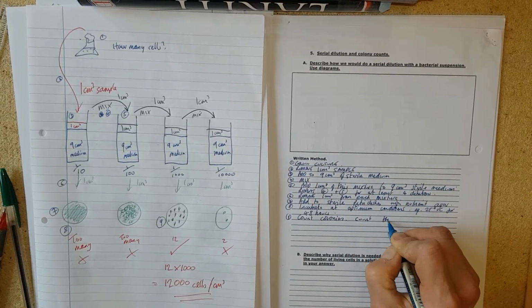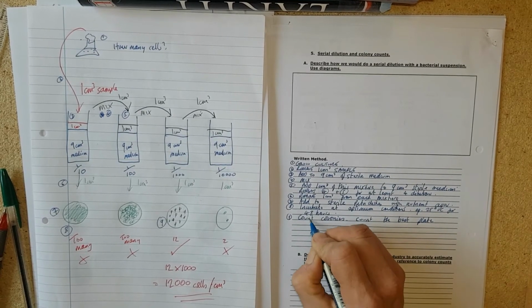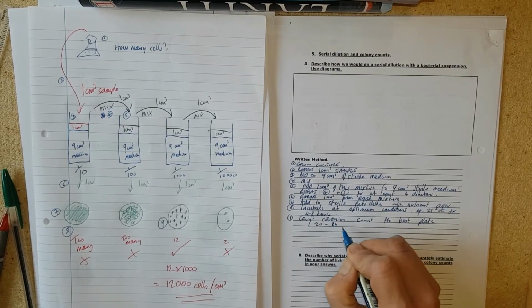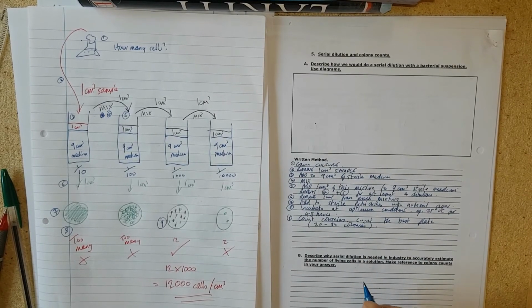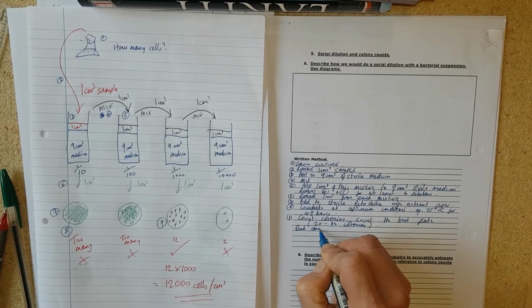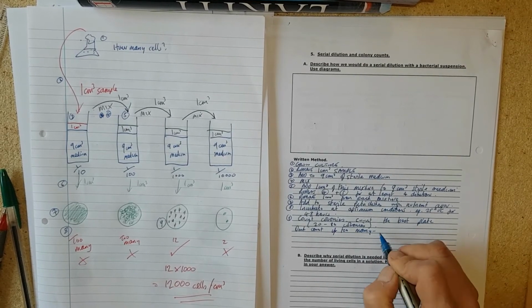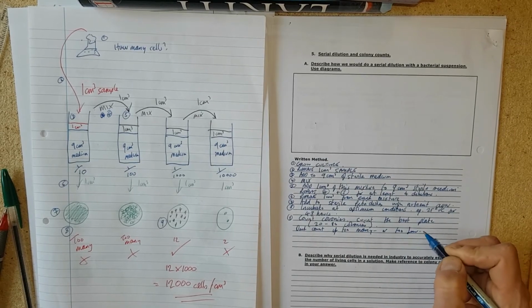Count the best plate, which is anything sort of between 20 to say 80 colonies. Don't count if too many or too few.